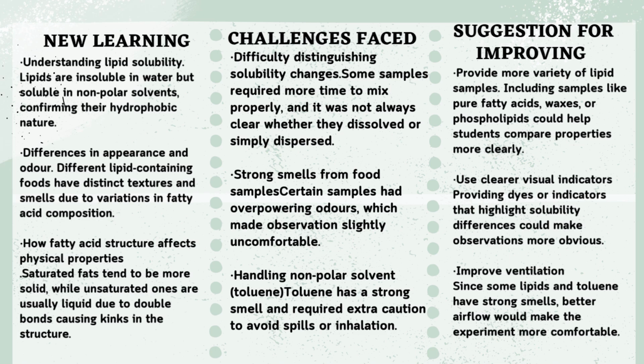There are a few challenges that we faced during this practical. One of them was distinguishing real solubility changes. Some samples needed more time and mixing, so it was not always easy to tell whether a substance had actually dissolved or was just finely dispersed in the solvent.